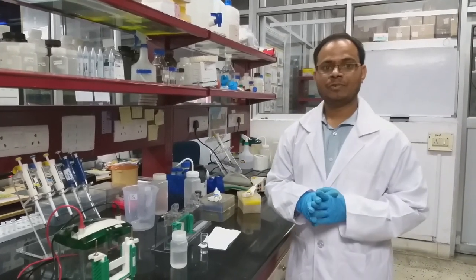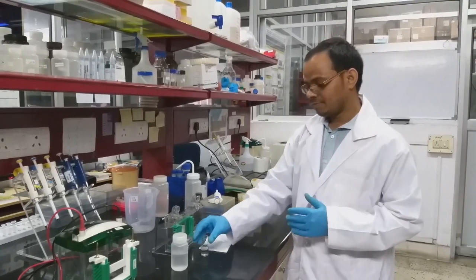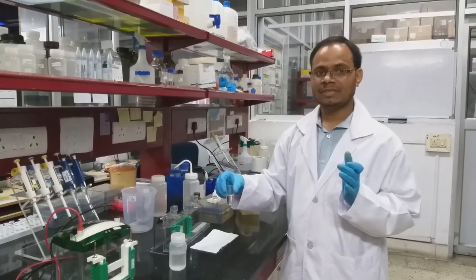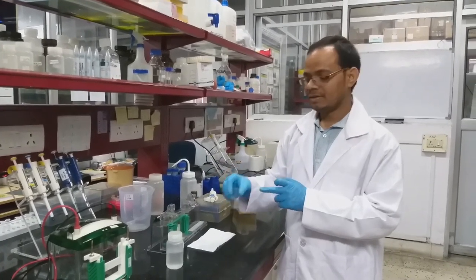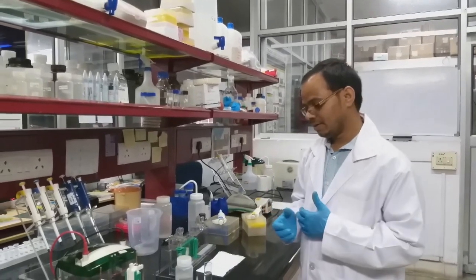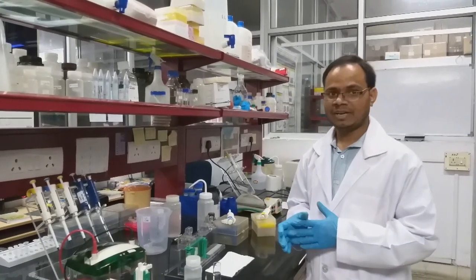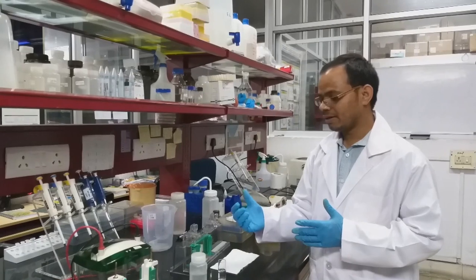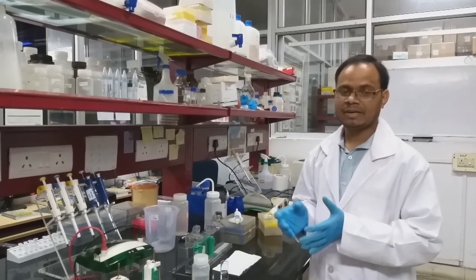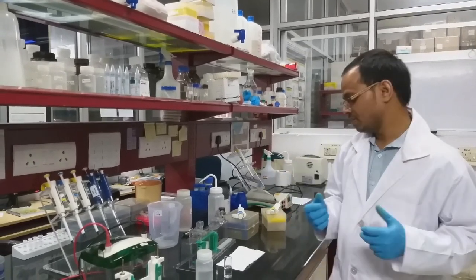In the final step, we have to add TEMED. After adding all the components, at the end of the gel preparation we have to add TEMED, because if you add it earlier, it will quickly facilitate the polymerization, so you cannot take it out with the pipette, as it completely solidifies. So that's why you have to add it at the end of the resolving gel.